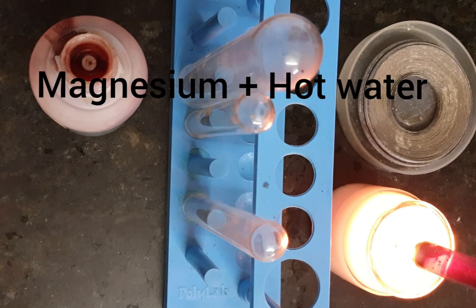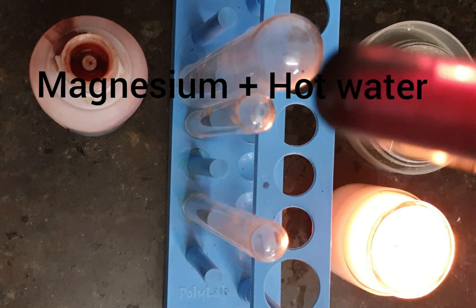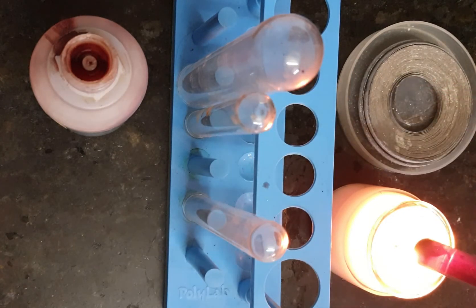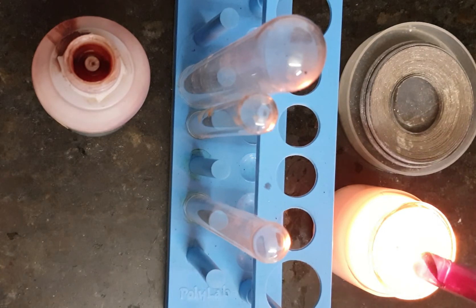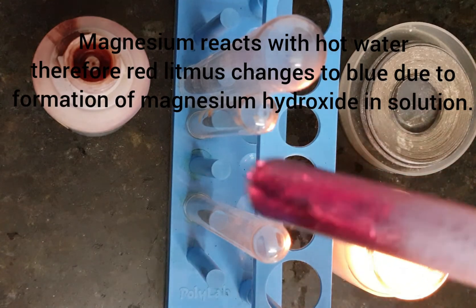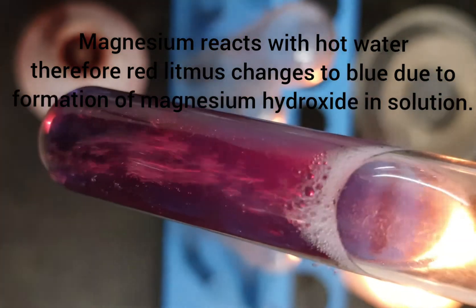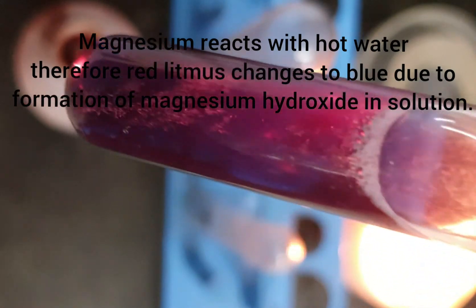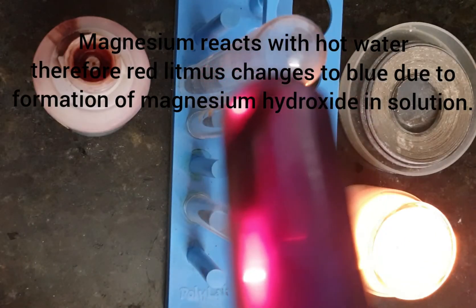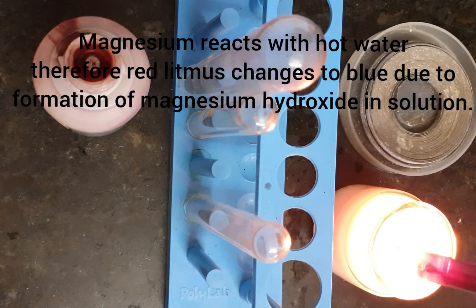We can see that there is some reaction taking place, as the color at the bottom has started changing. See, it has started changing to blue — let me give you a closer look. The red is changing into blue, so the reaction is taking place. Let's warm it a little more. Magnesium ribbon does not react with cold water but it reacts with hot water.